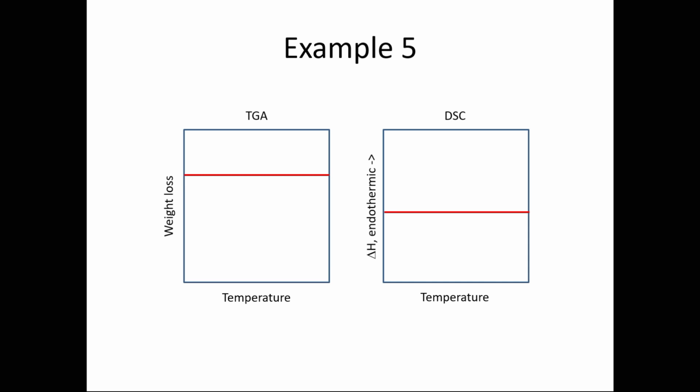It means that this particular sample, when it was analyzed, doesn't show any thermal events in the given temperature range. The sample is completely stable and doesn't show any melting or any other events.